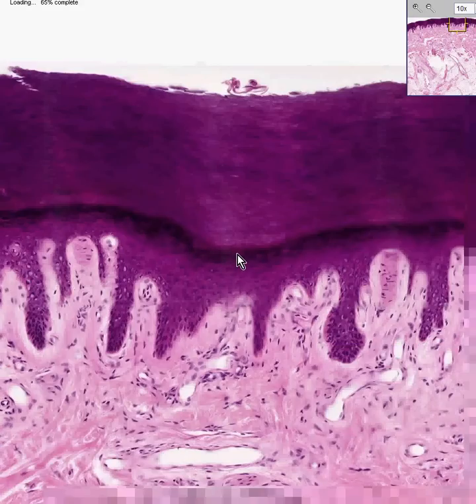Once again: the basal layer, all of the cells in here are the stratum spinosum or prickle cell layer. Here is a thick, beautiful stratum granulosum — all these dark cells are filled with keratohyalin granules. And then all the way from here to here is your stratum corneum. This is thick skin, and I thank you very much.